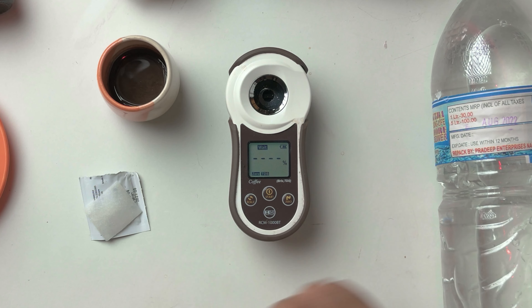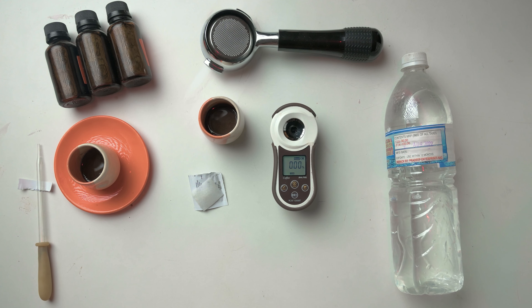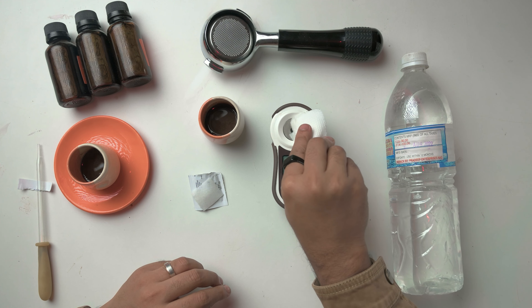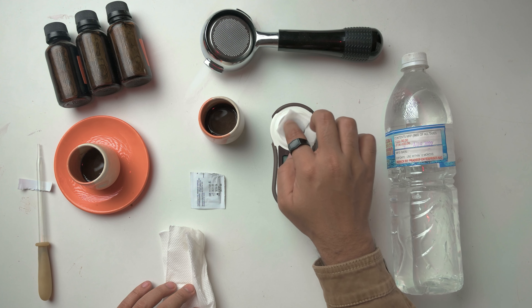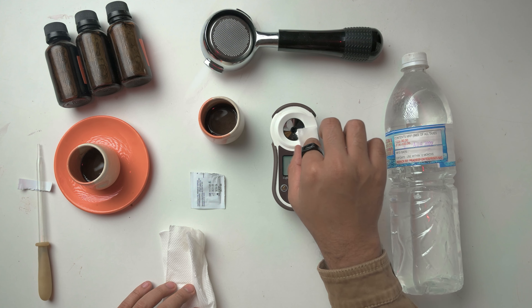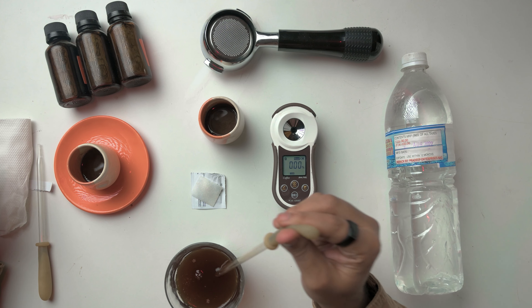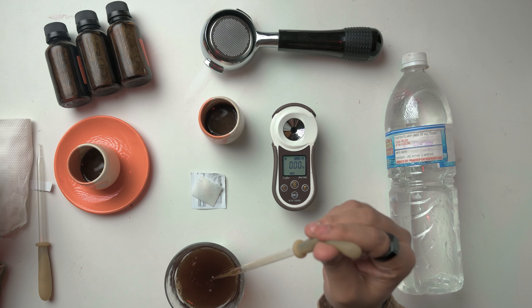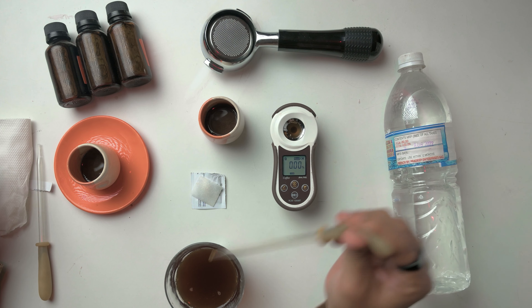To use the refractometer, first take an alcohol swab, tear it open, wipe the lens, and keep it aside — you'll reuse it. Then take the pipette, put a drop of distilled water over the refractometer lens, and this is how you reset it. Press zero, and that will reset your refractometer. Then after that you can start using it. I've pressed the zero button — there you go.